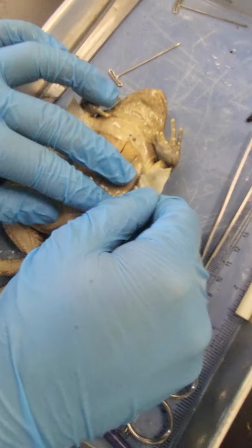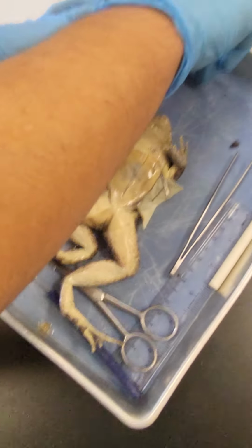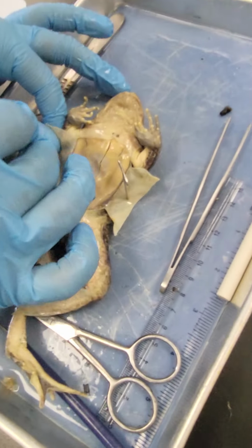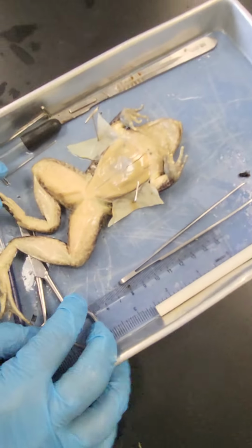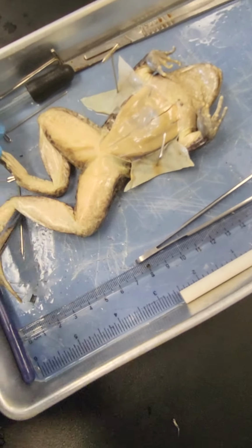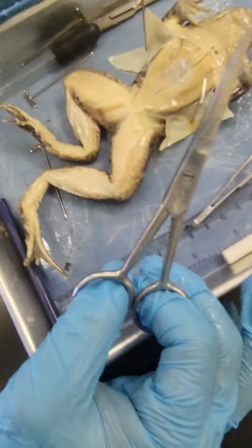Right, we can't tell, the frog has a six pack. He's not buff. This frog is not buff. It's not buff. A female, yeah. The frog didn't work out at the Y. So it's definitely a female, though. Okay. You've already seen the egg. It doesn't have abs. Oh my God. Abs. It's a female. Right?